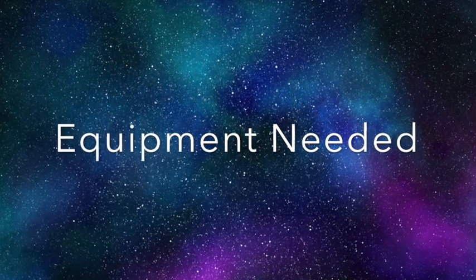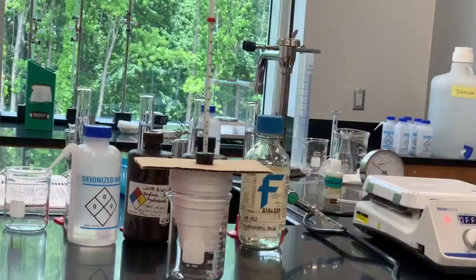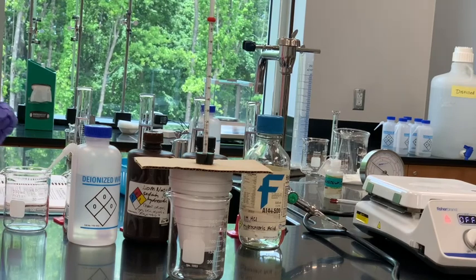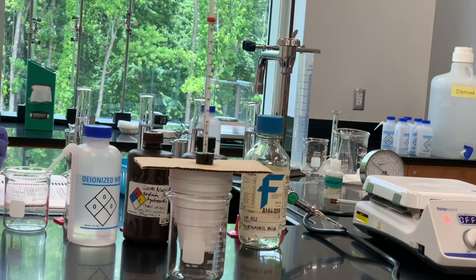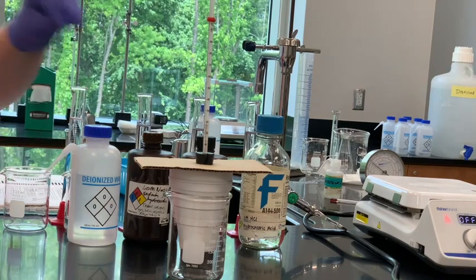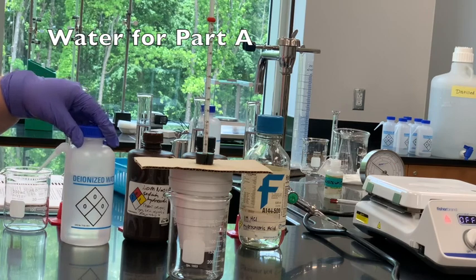This slide is the heat of neutralization. Before we get started with any of the procedure parts, I'm going to show you what we're using. We have several different graduated cylinders to measure out our chemicals. Remember when the procedure tells you to measure, say, 50 milliliters or 25 milliliters, you want to do that inside a graduated cylinder. I have several here, kind of matched with the chemical they currently contain.